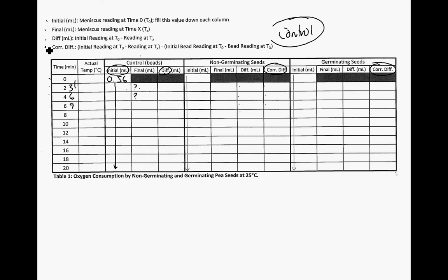Following this, we are going to do some data analysis. We're going to use this to talk about standard deviation, standard error, and we're going to then calculate a z-score for your individual group. Okay? So that is materials and methods for the lab.